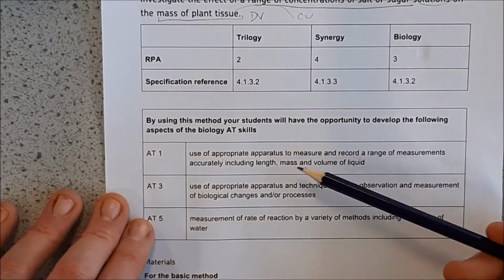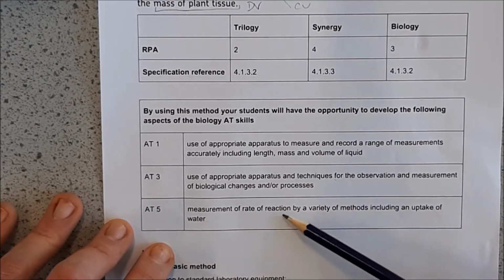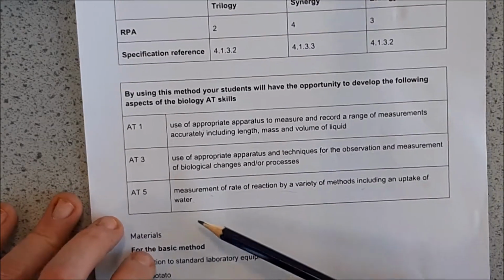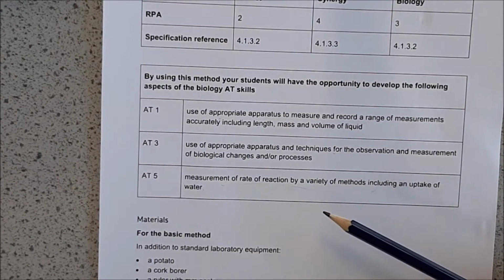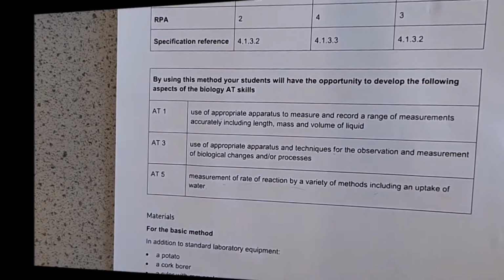So these are the different skills: appropriate apparatus and techniques for observation and measurements of rate of reaction by a variety of methods, including uptake of water. So we can work out the rate of reaction by looking at how much plant material mass has changed over time.